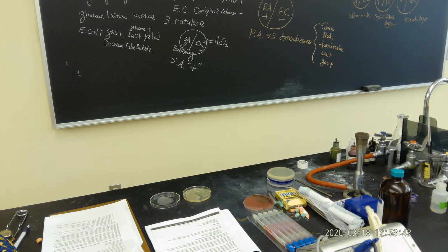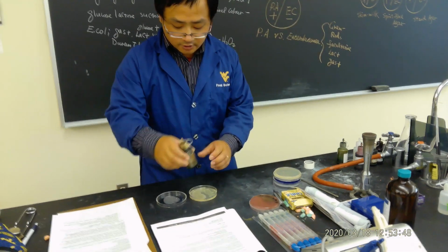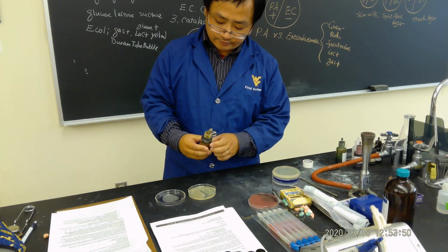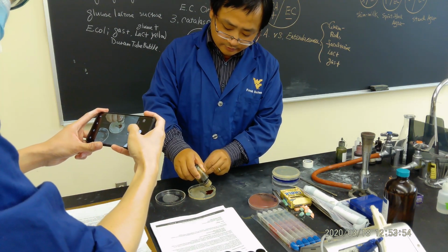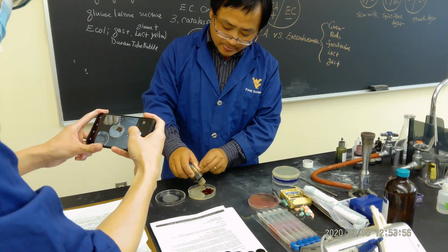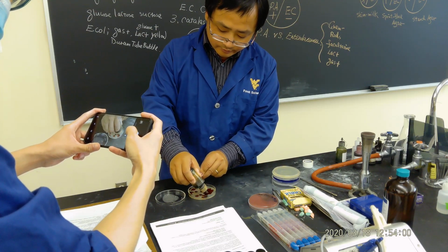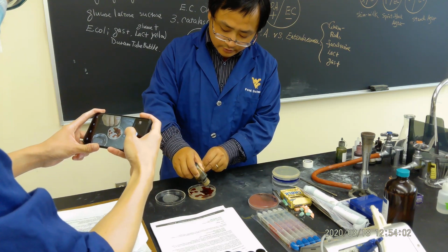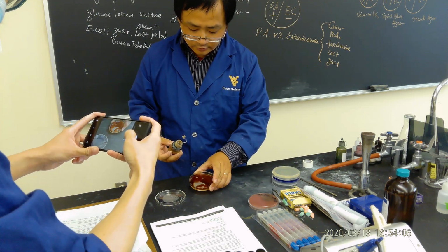This one right here. Okay. I can do this for you, and you can come here to take a picture. So we want to put these on the side. Okay. We want to go to the other side. We're also going to put it. We want to mix it.